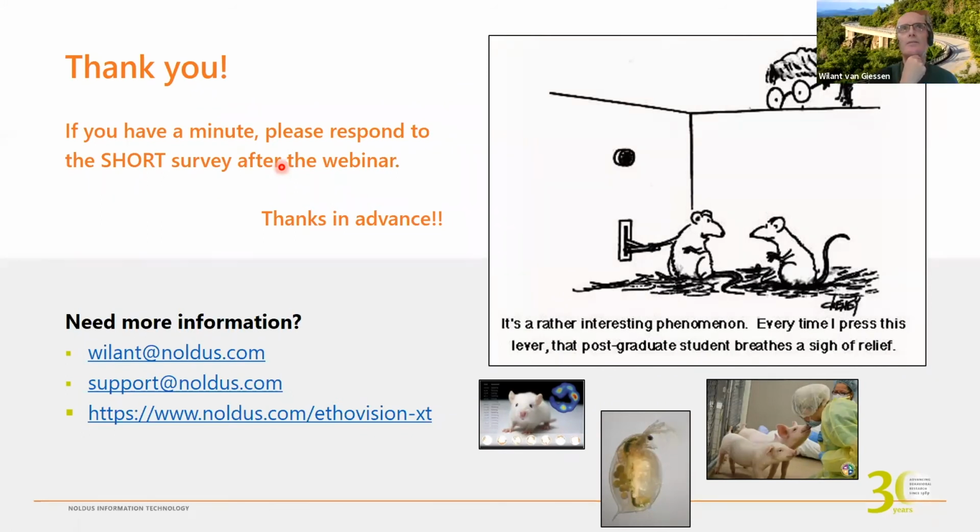Yes, you would have to put that in your trial control thing that triggers a counter every time it goes above a certain speed, and then later you can find that counter in your data. Yes. Also, you can use the dichotomized variable of movement, and then you could say the number of times the animal moves faster than X velocity, count it as moving, and then you would be able to get the frequency of the movement as well.